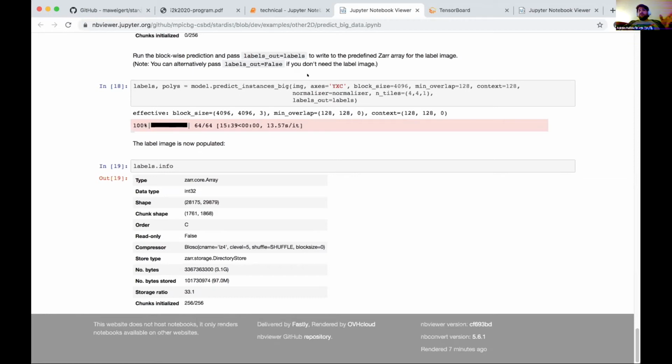It's totally feasible. You take one of the pre-trained models you have already, and then just train it with your small data set with a very low learning rate and see if it performs well. It's one line of code extra: just before you train a model, load from pre-trained. That's it. There might be some details, maybe we need to make a copy, and there are some little technical issues, but it's nothing complicated. Okay, thank you.